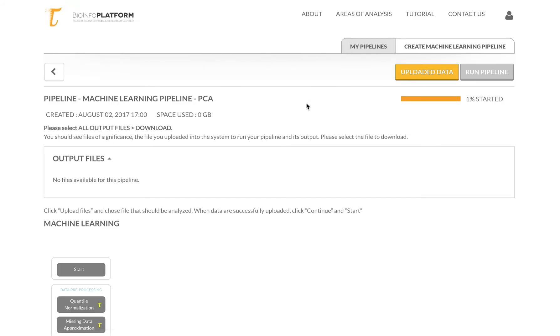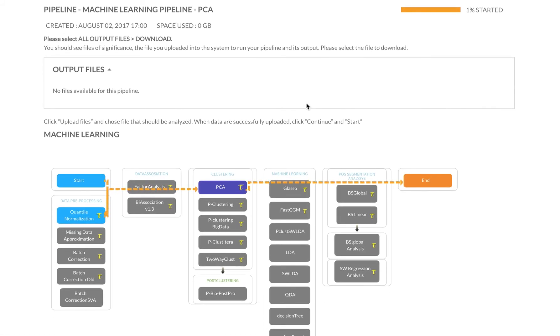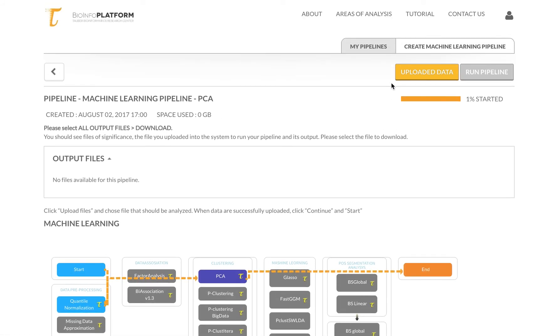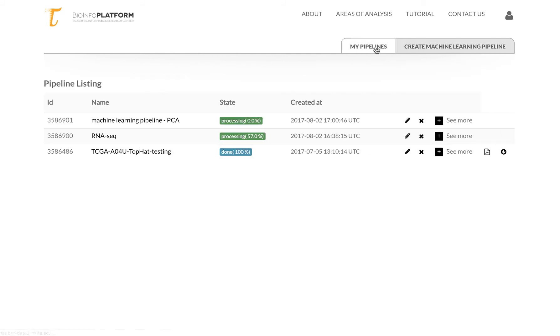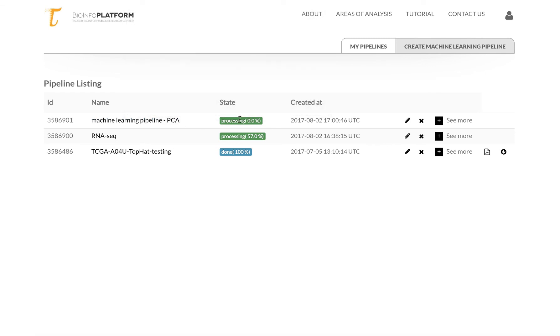You can see it's started. It's reloading. Now I can go to my pipelines. You can see that my RNA-seq pipeline is running, and the machine learning pipeline is also processing.